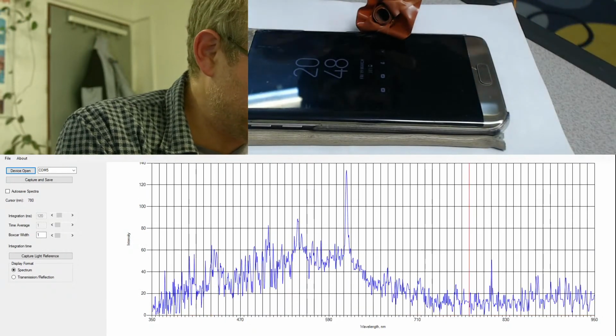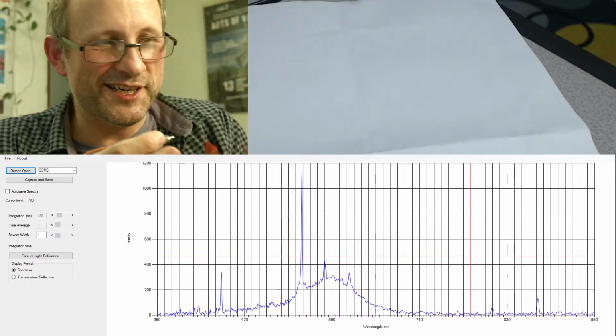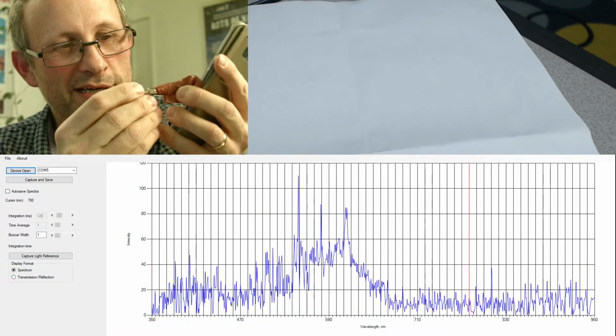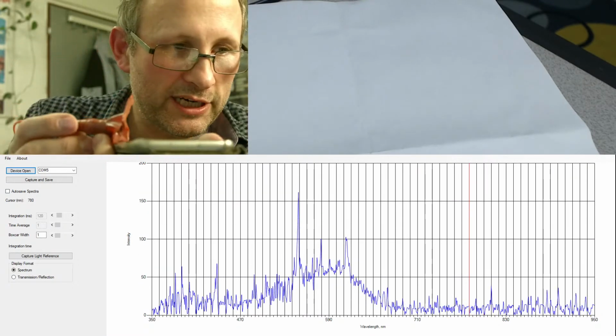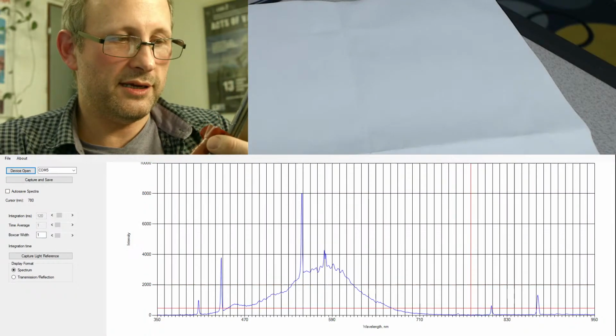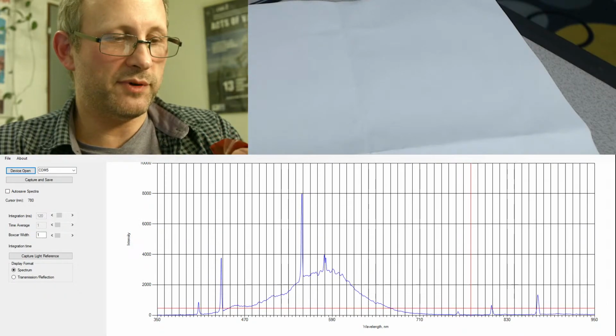And like I say, it's quite satisfying to insert this into here. I should probably not get so much pleasure out of doing that, but I do. And I've got it looking at a part of the screen where there are no other instructions for the Strobely program.